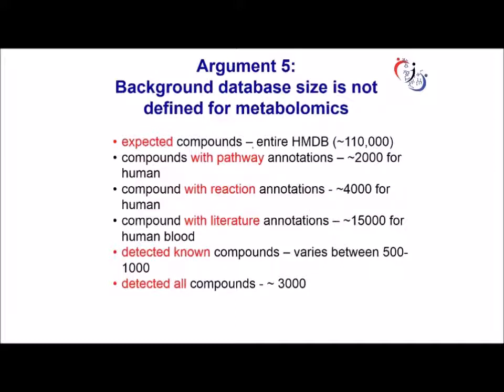So there is a huge variation in these different background databases, and which one should be used for metabolomics is not defined.